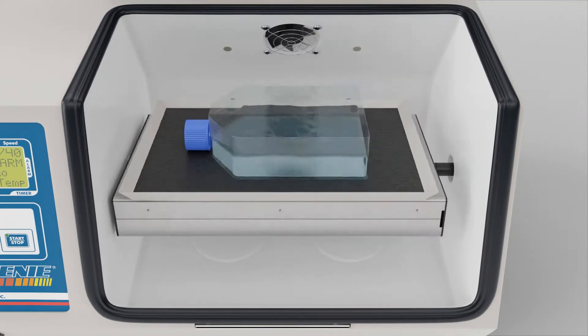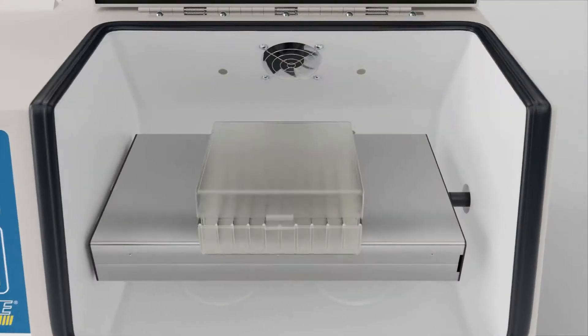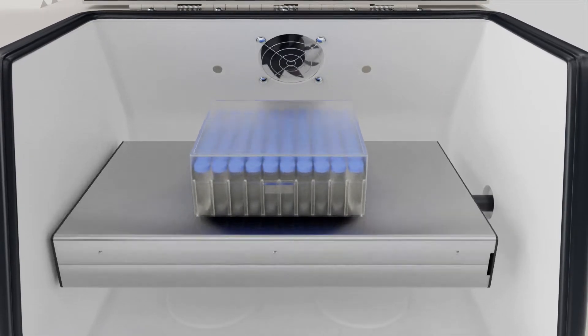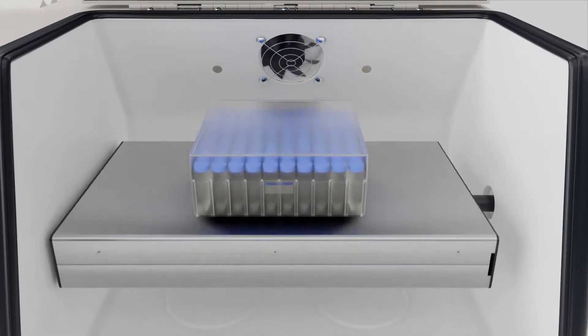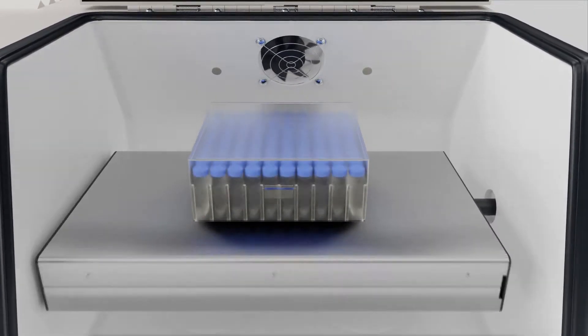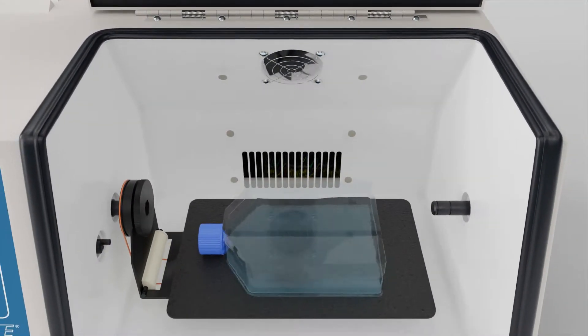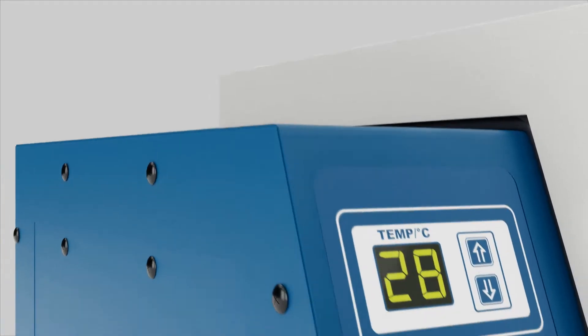Quickly switch to the 100 microtube box for your protein work with magnetic beads, or add the horizontal and 3D orbital attachments for your western blot analysis.